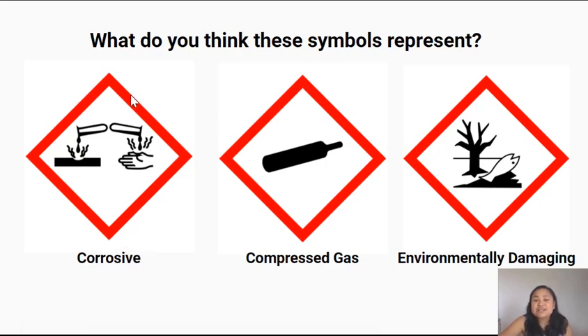You have to be really careful with corrosive things like acid because if you get it on your skin, it's going to burn you and irritate your skin. Now this symbol here — it's not a cricket bat — it's actually a gas tank containing compressed gas, which is gas tightly packed into a container. This has the potential to explode.